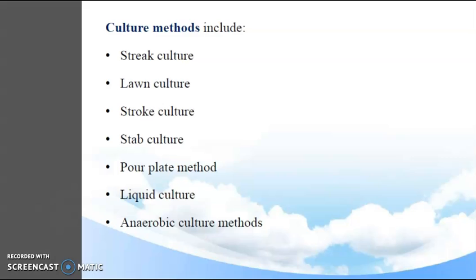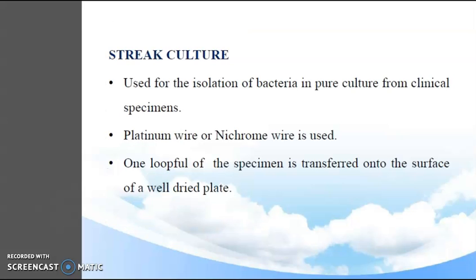Culture methods include streak culture, lawn culture, stroke culture, stab culture, pour plate method, liquid culture, and anaerobic culture methods. Let's see these one by one. The first one is streak culture.